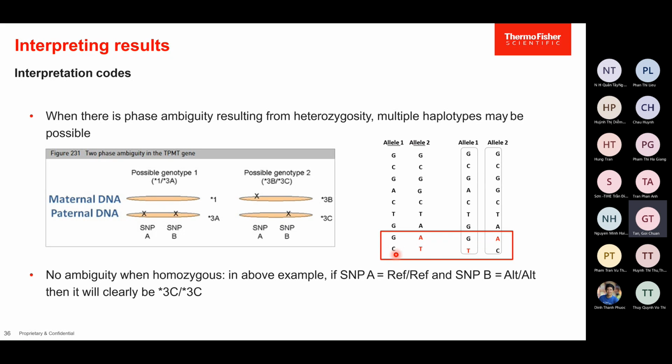Okay, here, the last one. It can be TCT, but it can also be TC. It can flip. So our software will take into consideration what if I flip it over, what is the possible genotype or possible haplotype that you observe?